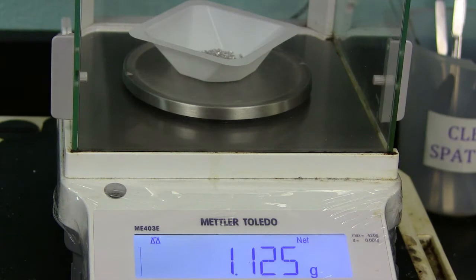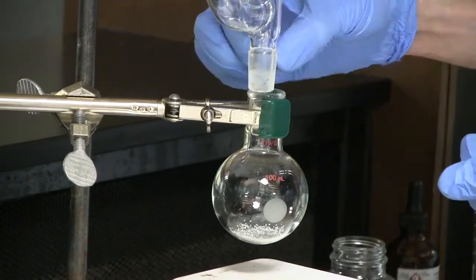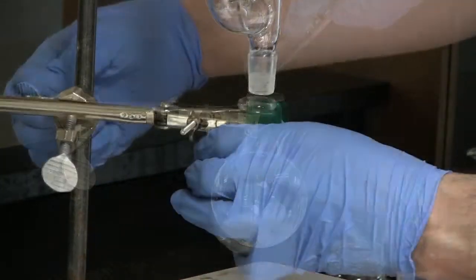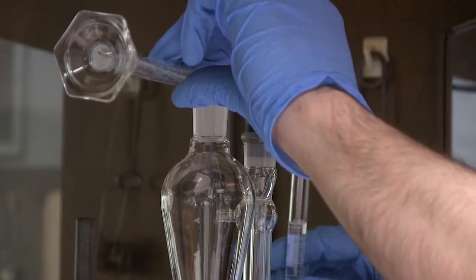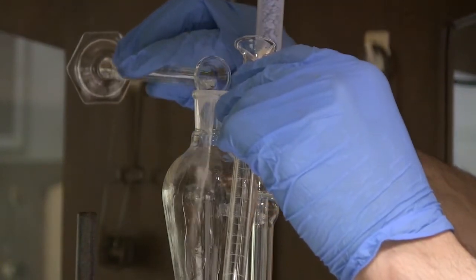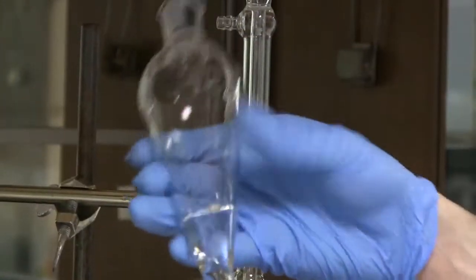Using a powder funnel, add 49 millimole of magnesium metal to the round bottom flask. Add a stir bar and/or a few boiling chips. Add 10 milliliters of anhydrous diethyl ether. Add 10 milliliters of anhydrous diethyl ether to the separatory funnel and add 51 millimole of bromobenzene. Lift the funnel and swirl briefly.